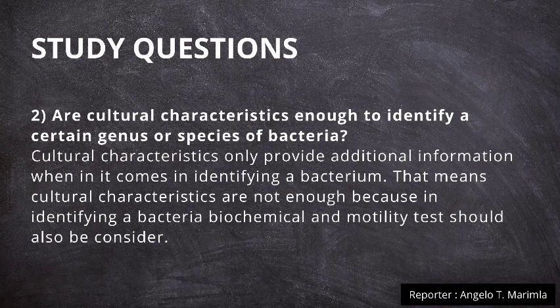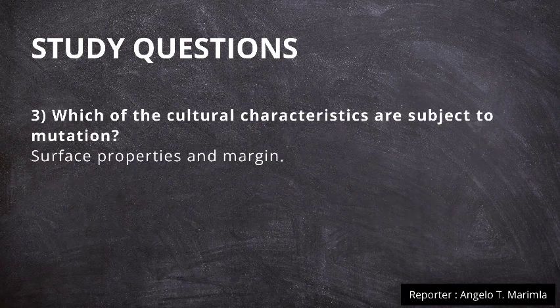And the last question is, which of the cultural characteristics are subject to mutation? Our answer is surface properties and margin.